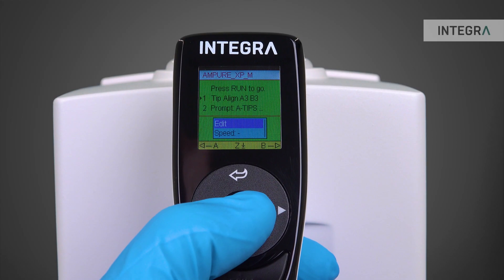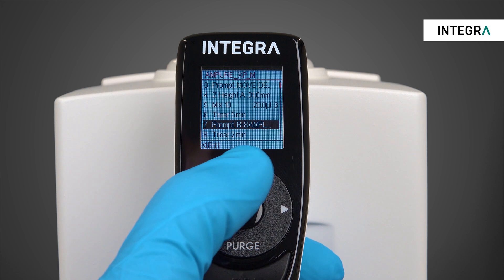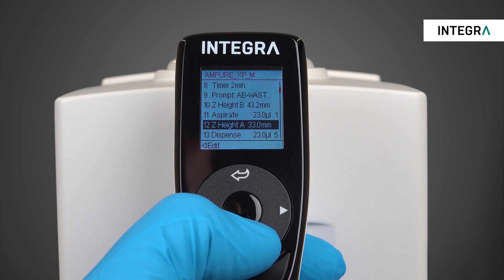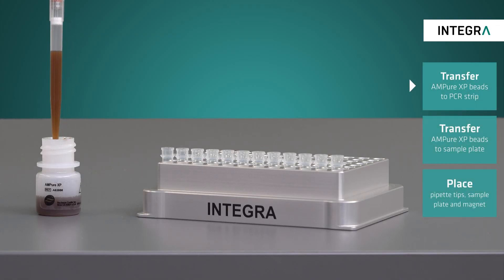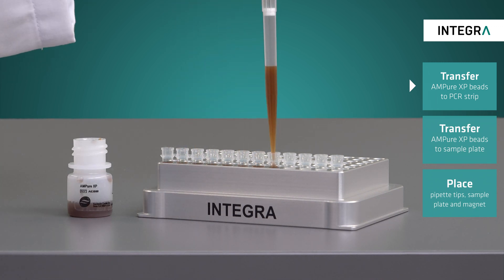The steps needed to run this procedure are saved as one single custom program called AMPURE_XP_M on the VIAFLO 96. It contains all the necessary volumes, prompts and heights. To start, the magnetic beads need to be transferred into 12 PCR tubes using a single channel 1250µL VIAFLO electronic pipette and a repeat dispense program, adding 154µL per tube.